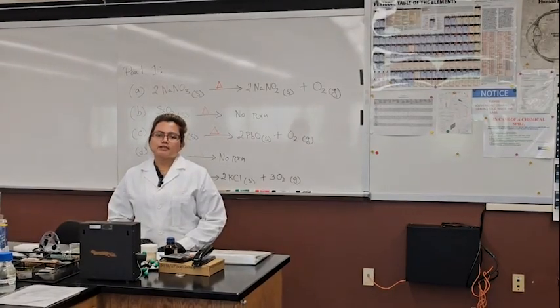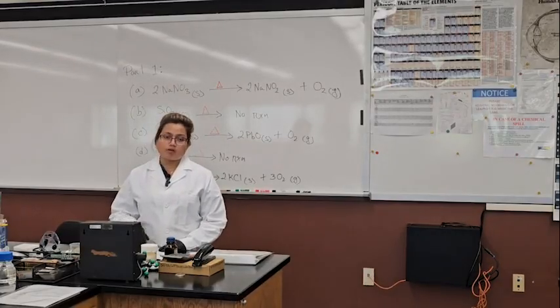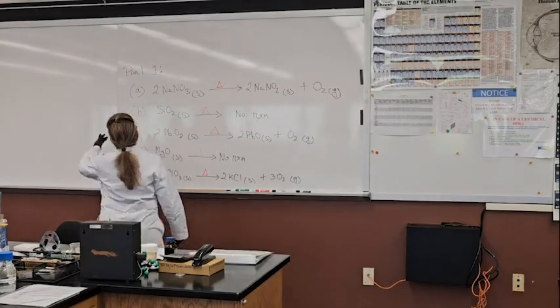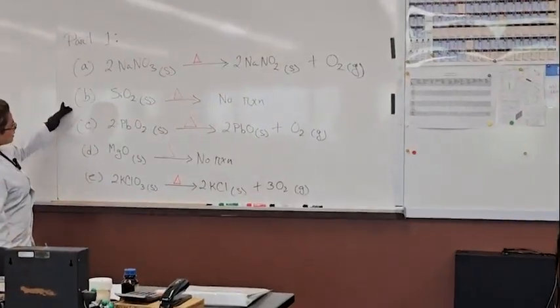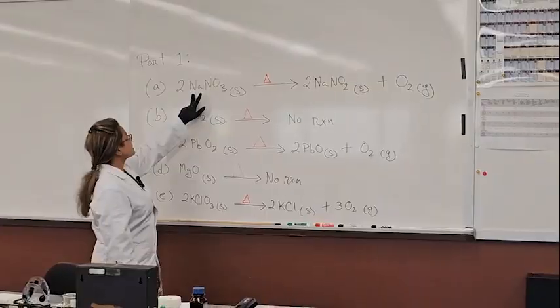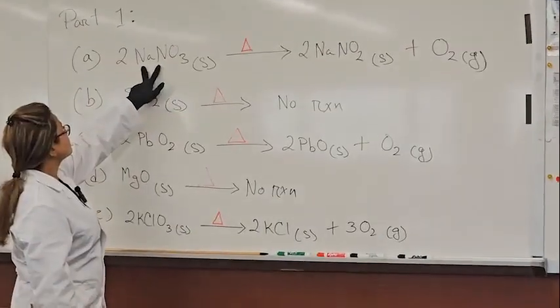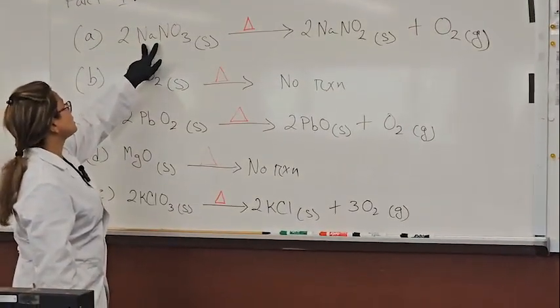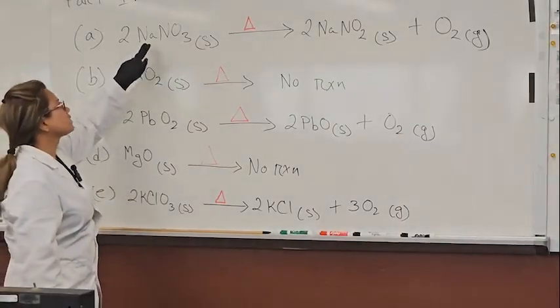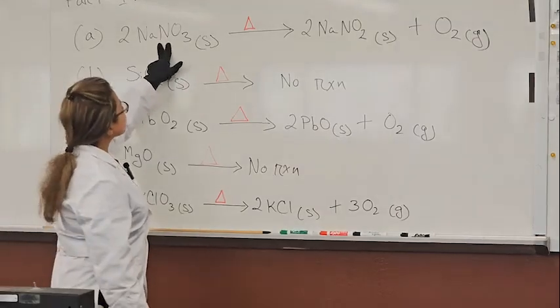Welcome to Lab 8. Lab 8 is about the preparation and properties of oxygen. We are working with different chemicals. Those are all complex compounds, which means we can see multiple elements together in them. So this is called a complex compound.